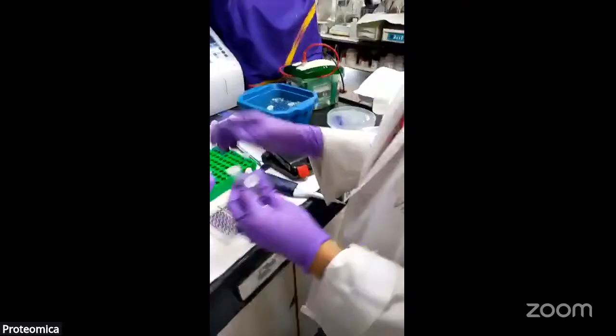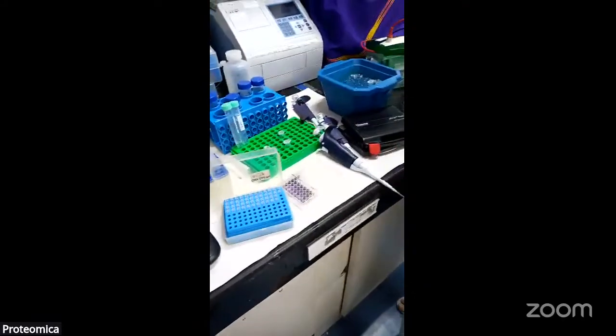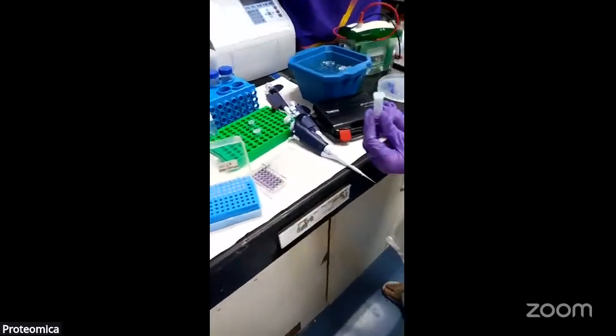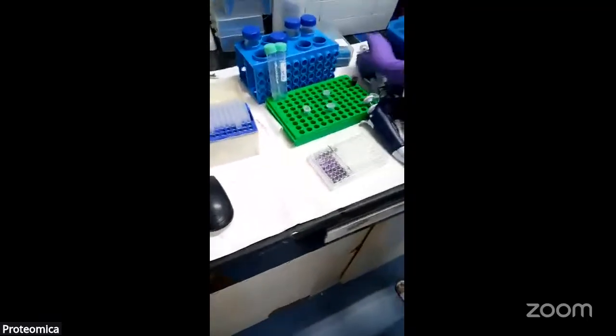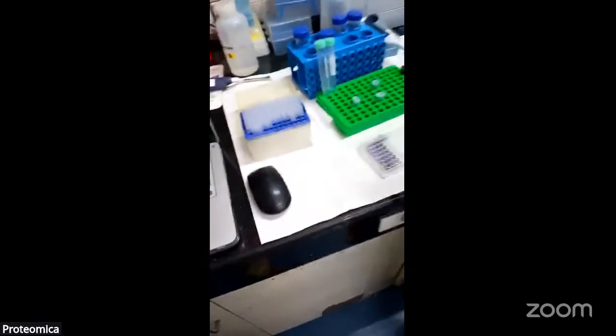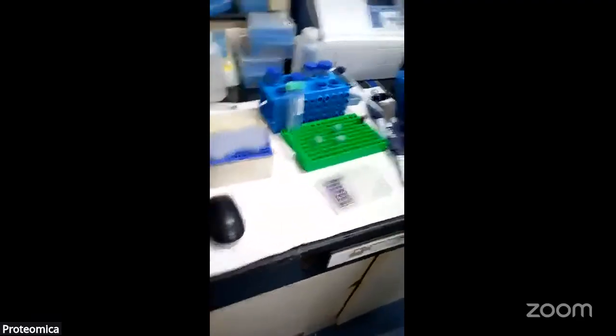So you put your trypsin inside in the concentration ratio of 1:30 or 1:20, which is widely accepted. And we incubate it overnight, for 8 hours. Now, two kinds of methods can be optimized. At 37 degrees for 16 hours or 8 hours, we consider that total digestion is already done. But you can do another second step, which is called double digestion.